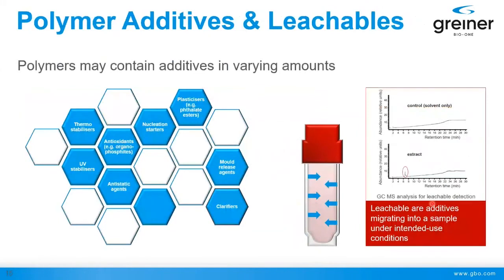This was biological contaminants, but there are also chemical contaminants which may be present in tubes, and you should at least be aware of the fact that there is something and something could go on. Polymers usually contain different chemical substances to allow for their processing in injection molding and production lines. There is, though, a huge variety of different substances you find or do not find, and also the amount varies extensively. Some of them are listed here.